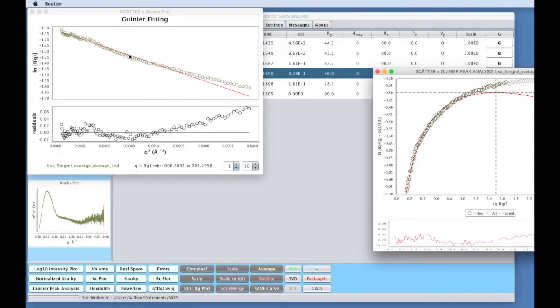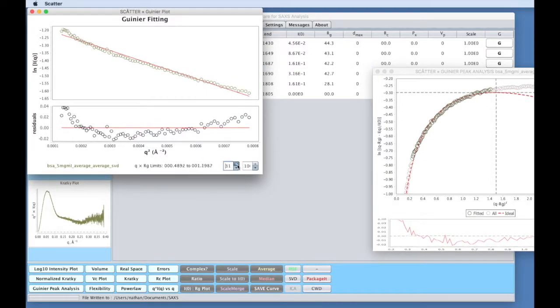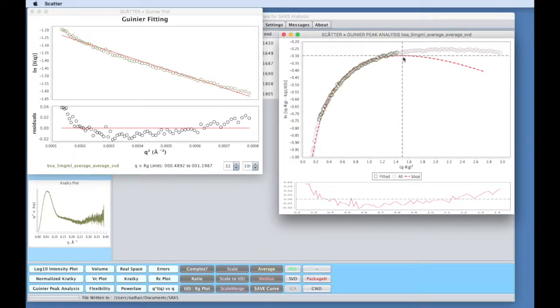So one way we can deal with that is if we start getting rid of data from the bottom. You can see, effectively when you get these kind of smile-shaped residuals, I could either truncate back from one end and just fit the data here, or I could truncate from this end and just fit the data here, and I would get two different RG values, and what is the right thing to do? And this is giving you a clue.